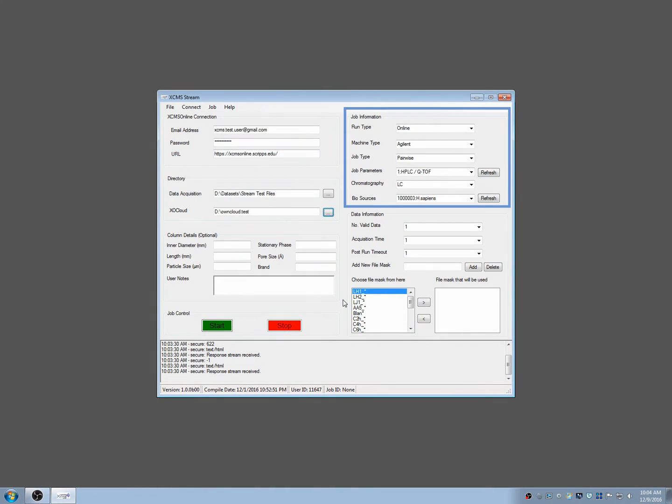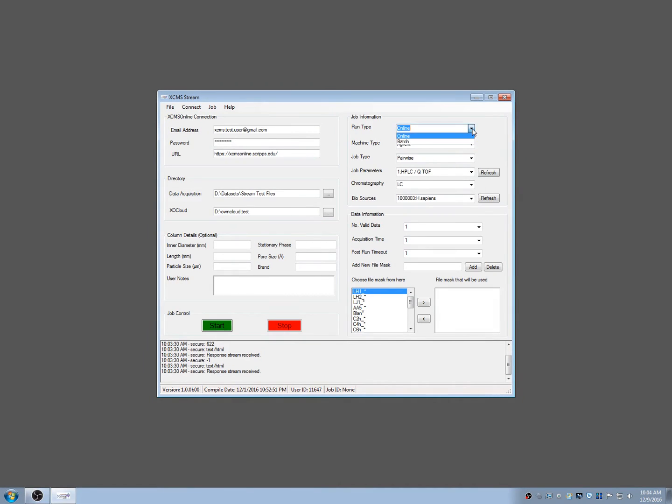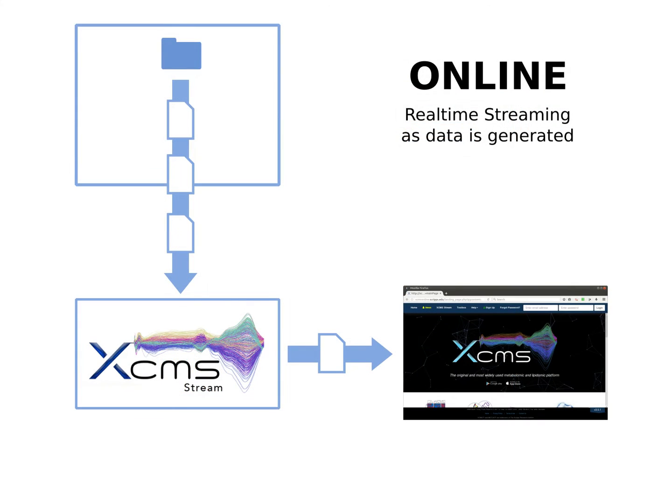Job information, however, is required. In the Job Information section, choose how XCMS Stream will run. Your choices are Online or Batch Mode. Selecting Online means XCMS Stream will compress and stream data as it is being generated directly from the instrument computer to XCMS Online. This significantly reduces upload times.